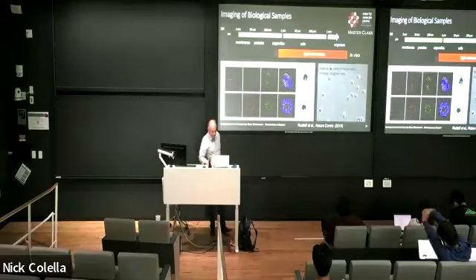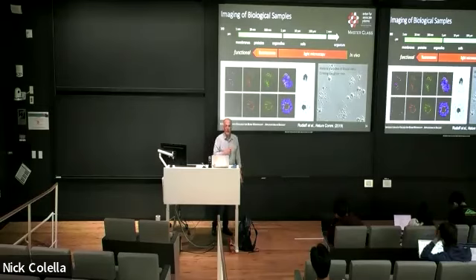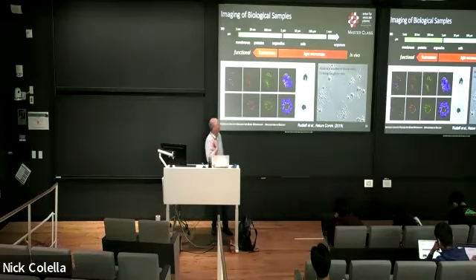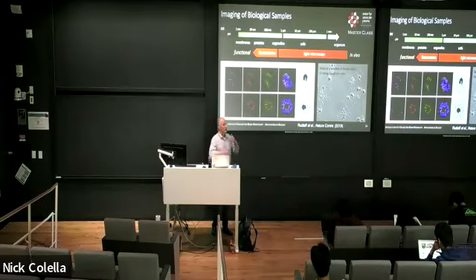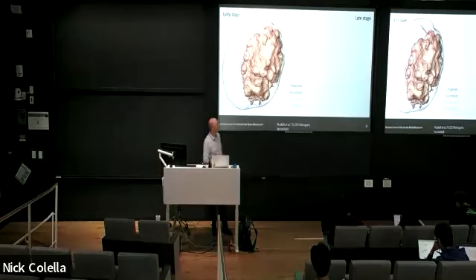And of course, they have done a lot of optical imaging, right? So optical imaging is the key tool for biologists. The challenge with these optical techniques is that you can visualize the location of specific components, but often it is then hard to understand the entire cellular context. And this is where focused ion beam or electron microscopy is still an important tool to augment the information that they get from their optical experiments. And so here's an example.